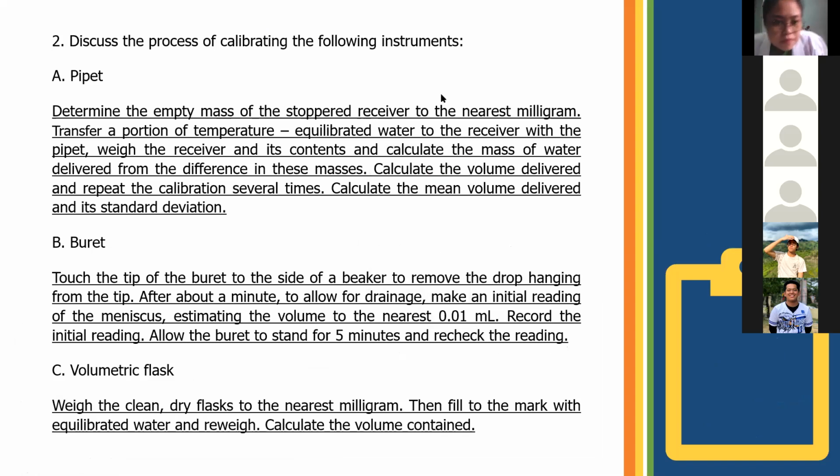So next is to discuss the process of calibrating the following instruments. So based lang to sa aming research. So yeah. So number 1 is the pipette.